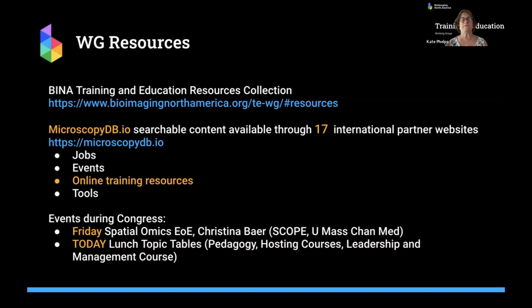You don't search it directly on the website. You go to one of the partner websites, and they have portals so that you can search the databases. We have grown very nicely to 17 international partner websites. The URL for microscopydb is shown here. Again, very simple. There are separate databases for jobs, current events, online training resources, and tools. The tools are things for calibration and measurement mostly at the moment.